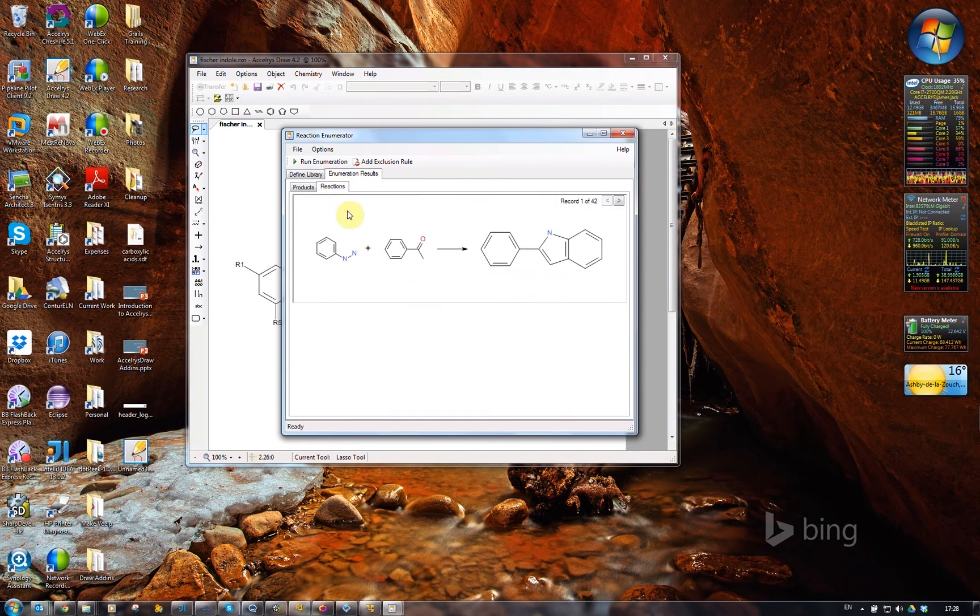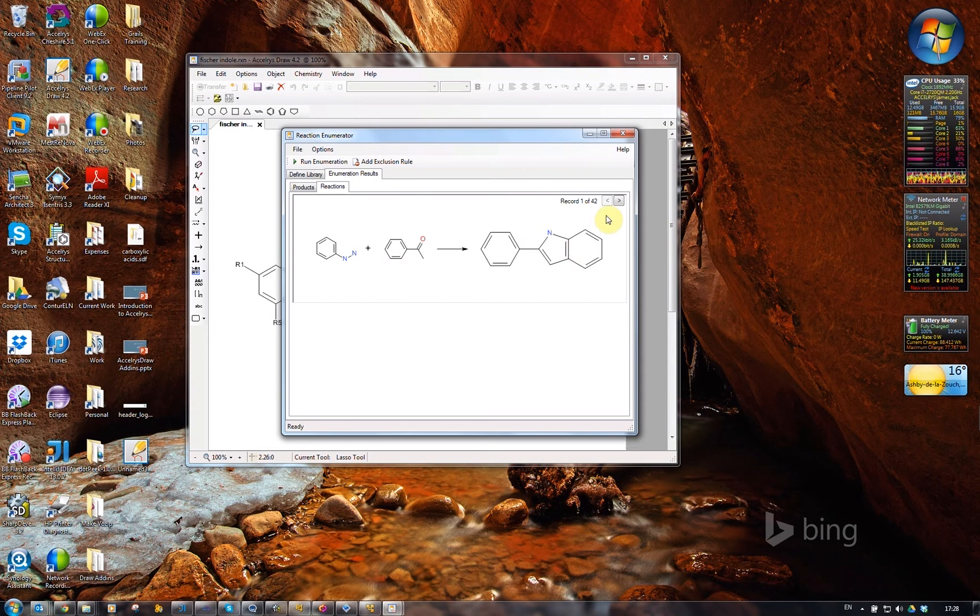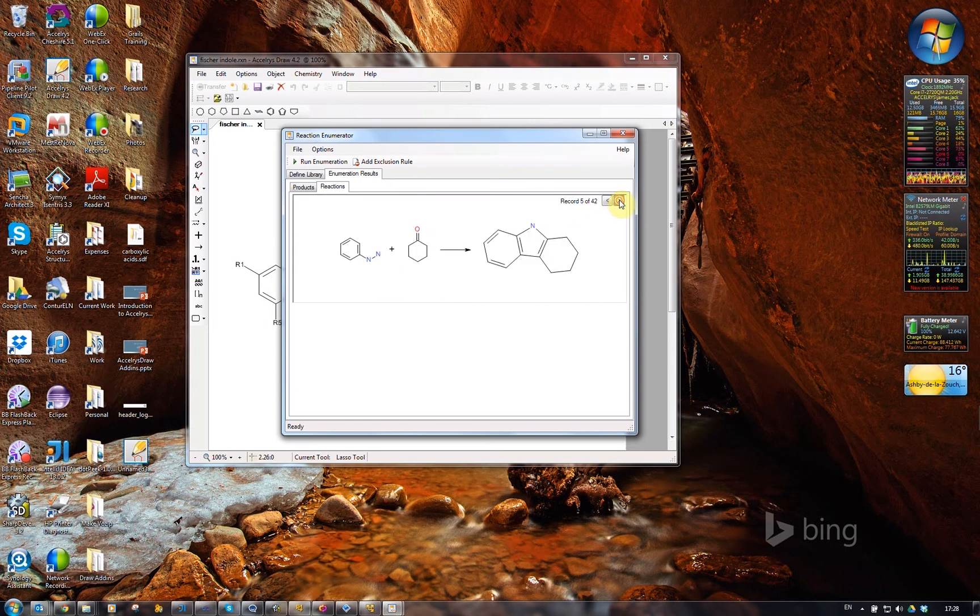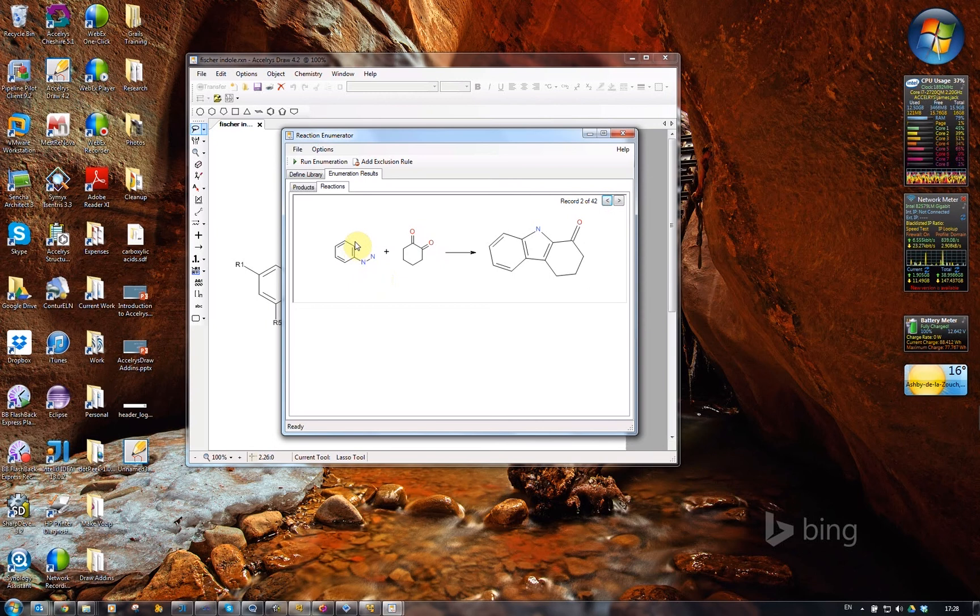There's also a reaction view, so I can navigate through and look at the different reactions that have been created.